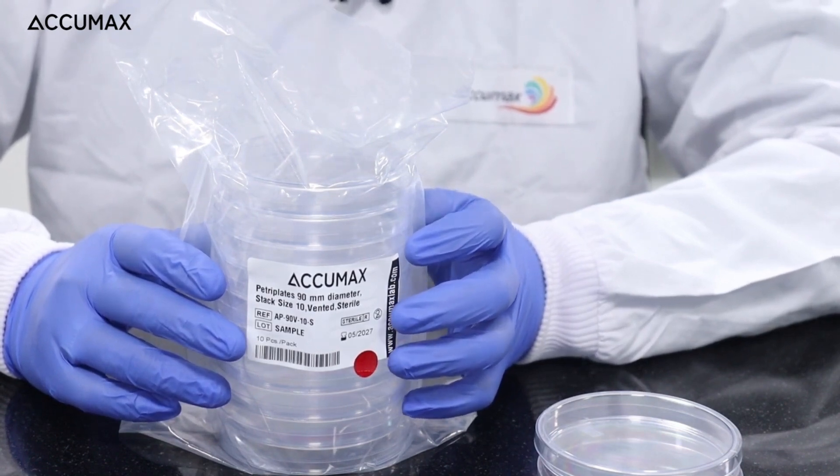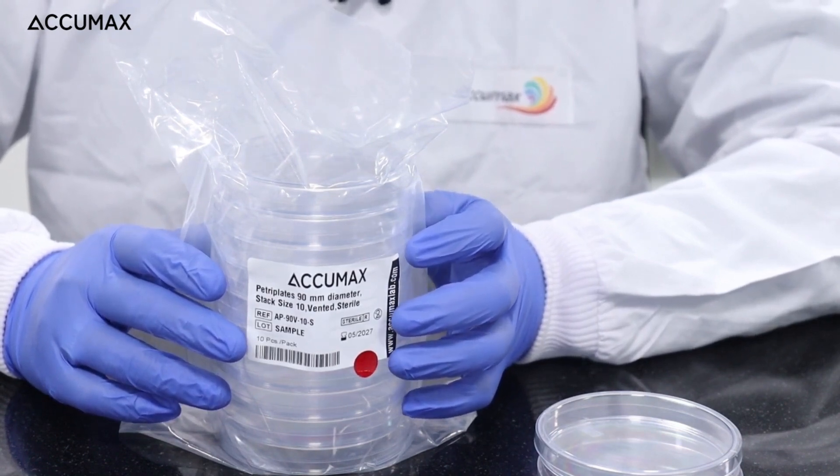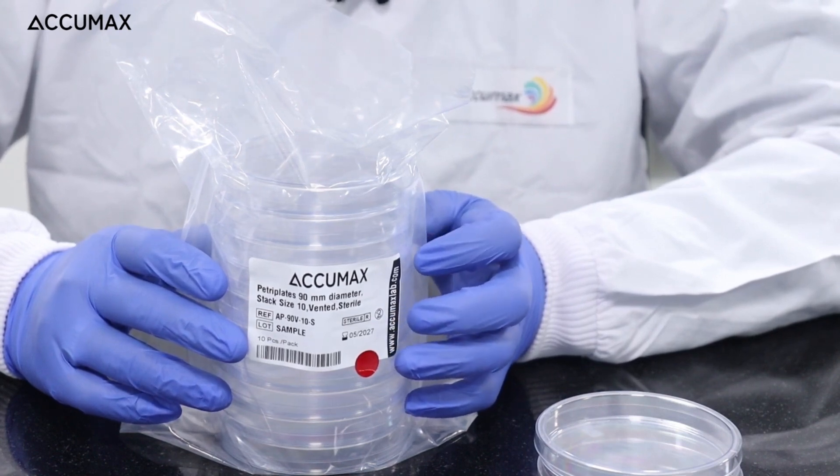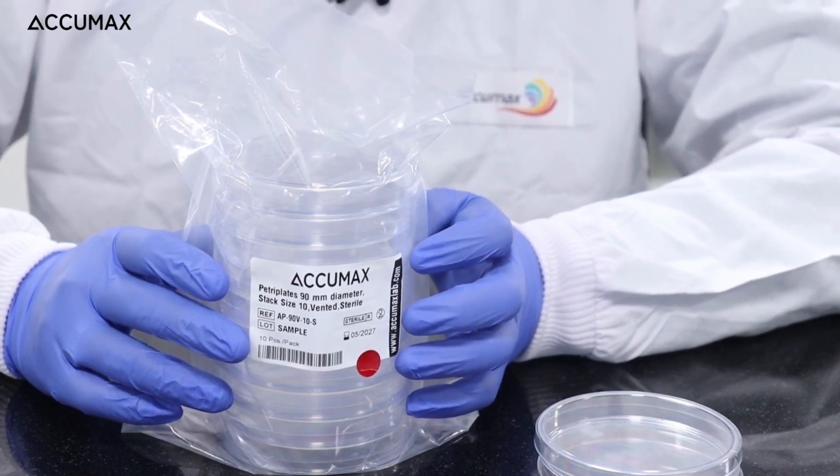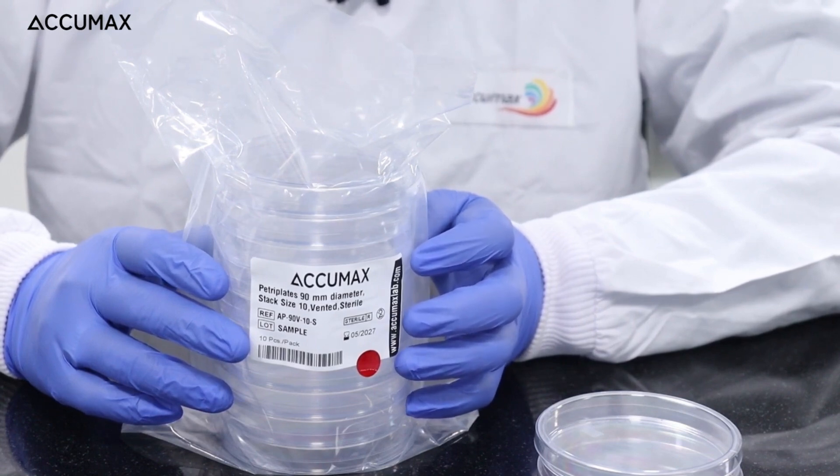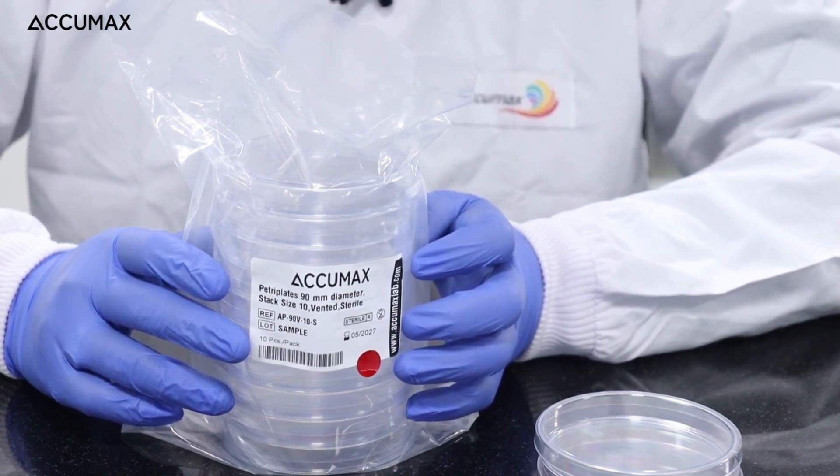While the sterility assurance level of aseptic Accumax petri plates is 10 to the minus 3, that indicates there's a chance of one organism out of 1000 surviving the sterilization process.